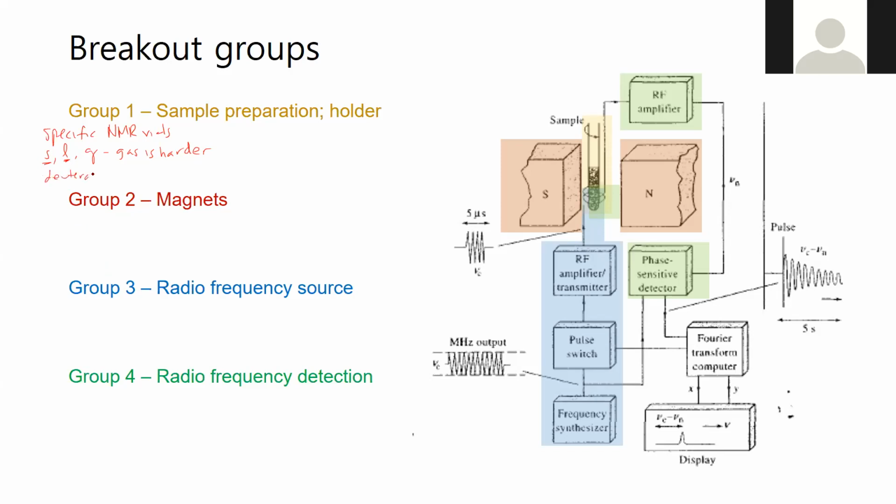The deuteration of the solvent is important because otherwise you'll end up picking up the protons in, for example, a water molecule versus deuterium oxide. Then you typically will have a certain amount of sample that you want to put in there. I personally tend to put around 10 to 15 milligrams in, but we found a reference that said anywhere from 5 to 25 milligrams is good for this.